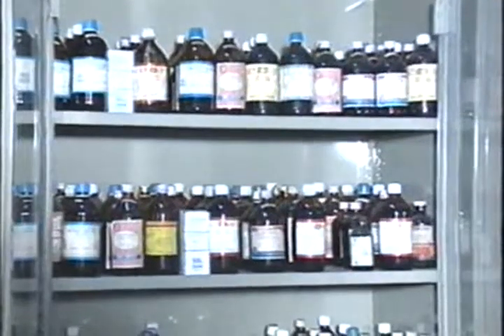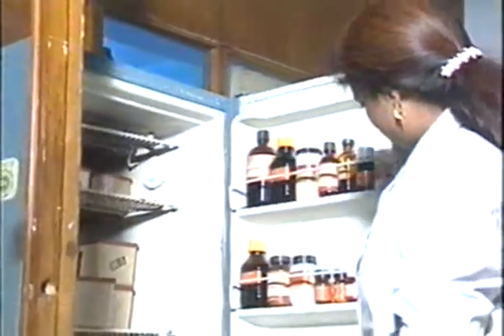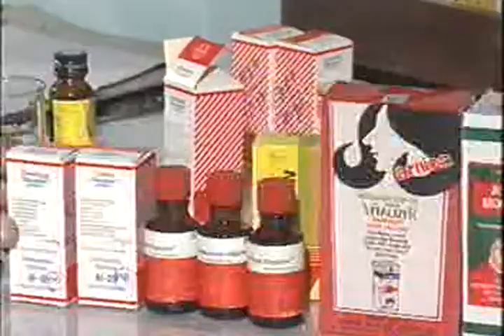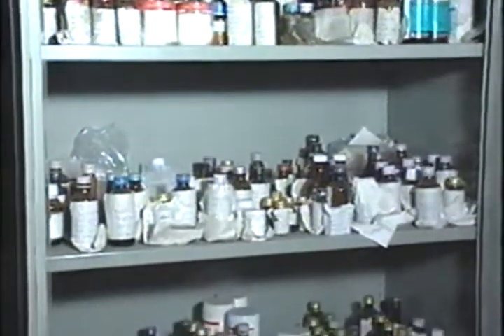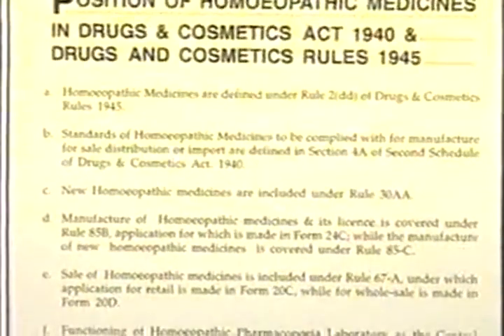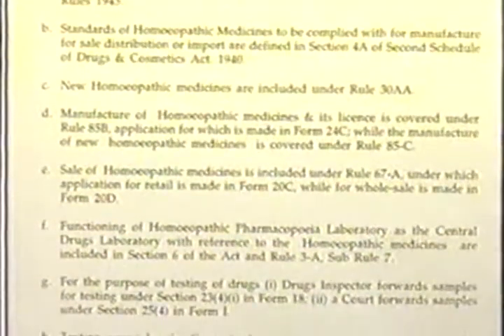A good collection of standard samples of mother tincture, purified active ingredients for comparative studies, and laying down of standards are maintained by the laboratory. Testing of survey samples, samples referred from state governments and port authorities, and various government agencies under the provision of Drugs and Cosmetic Act 1940 and rules are done basically using ultra-modern technology.